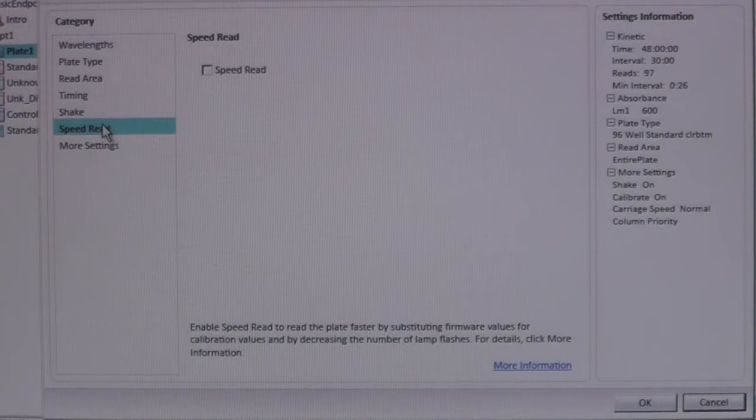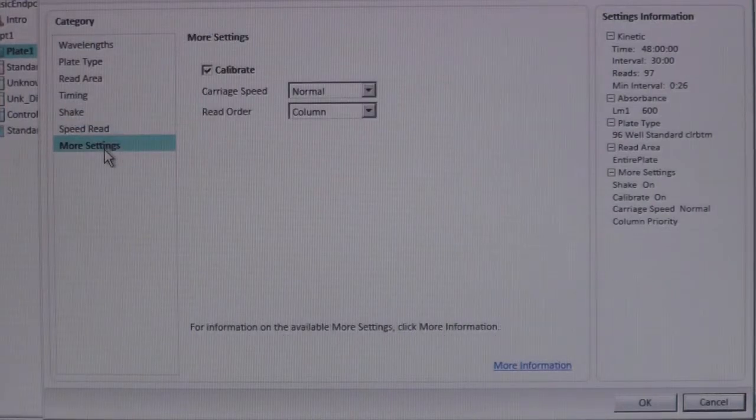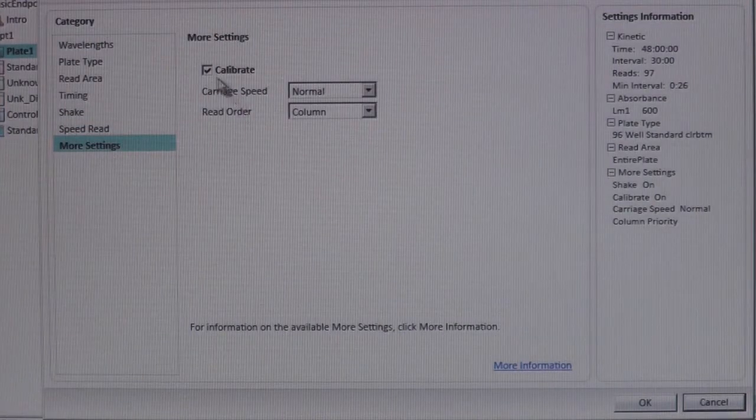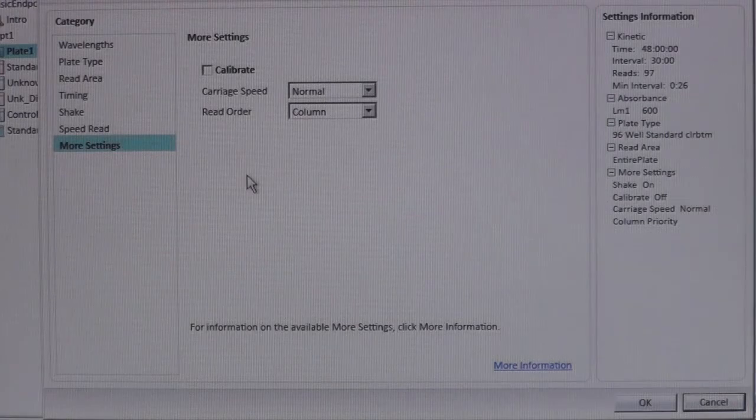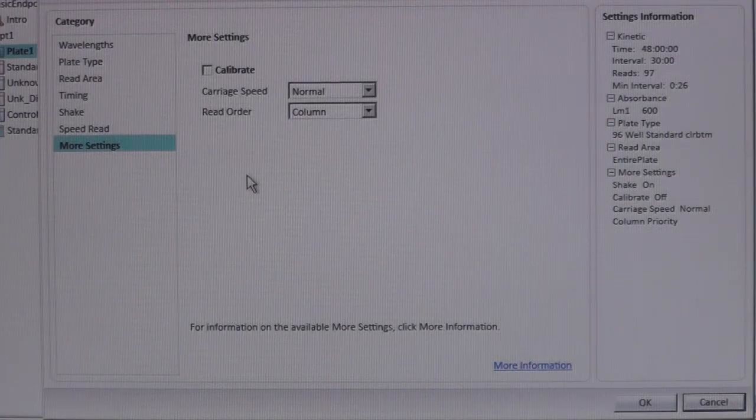In more settings, it's very important to unclick the calibrate box. Otherwise, condensation will form on your plate lid, leading to inaccurate absorbance measurements.